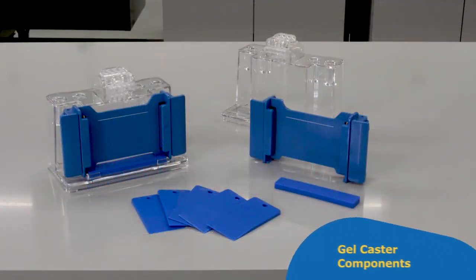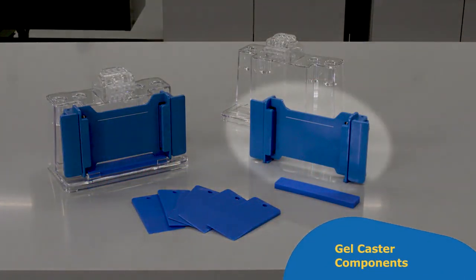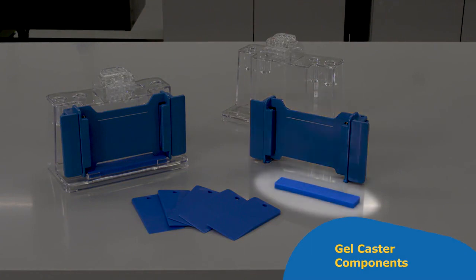The mPage Gelcaster includes two casting frames, two sealing gaskets, two gelcaster bases, and five gel releasers.